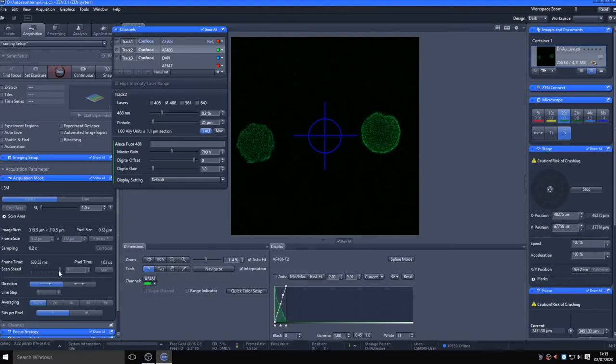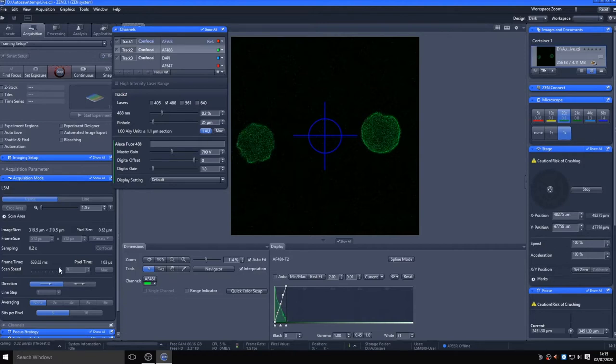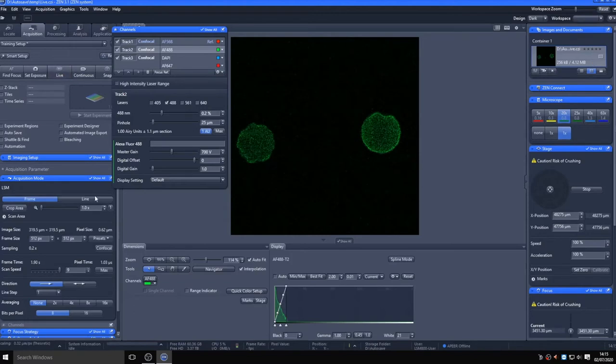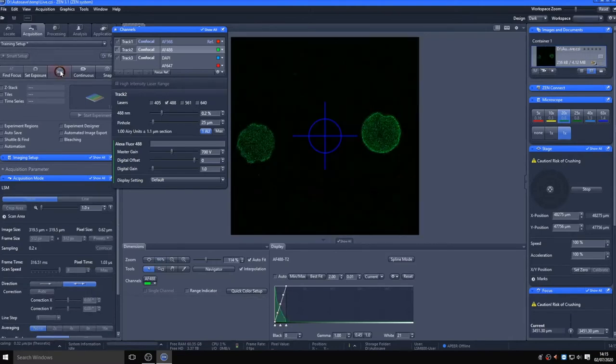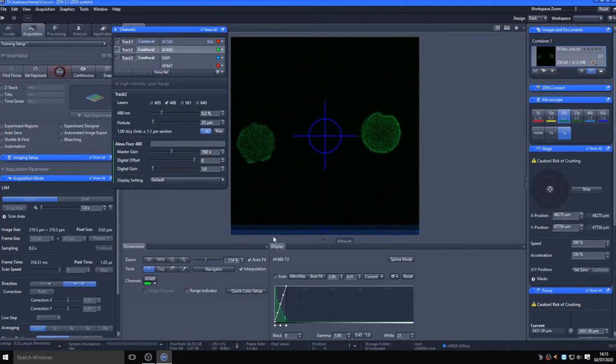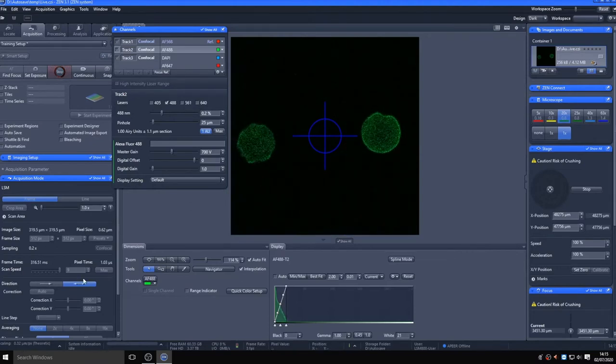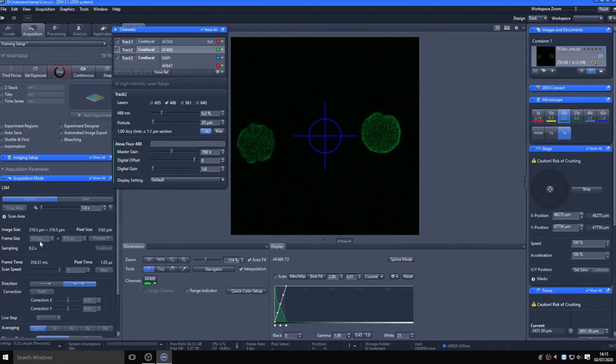Live only captures a single track, so in this case only the green channel, as this is the currently highlighted track. In order to speed up acquisition, you can switch to bidirectional mode, but ensure your images don't show any zigzag lines. This is unlikely to happen, but there are controls to correct for it if it does. Slowing your scan speed or reducing your confocal zoom will also reduce this effect. Here, the image looks fine.